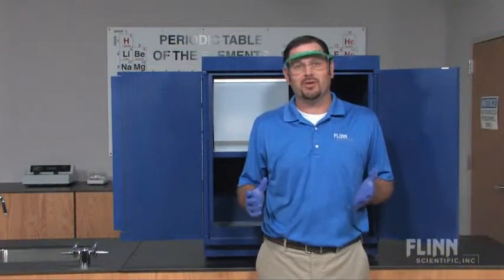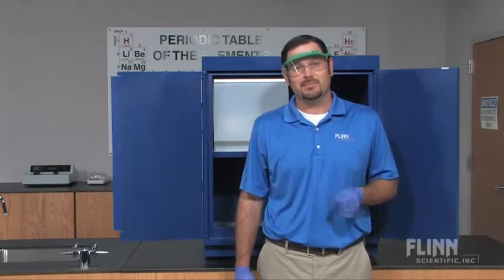Get your money's worth for long acid cabinet life by Flinn Acid Cabinets. They are metal-free.